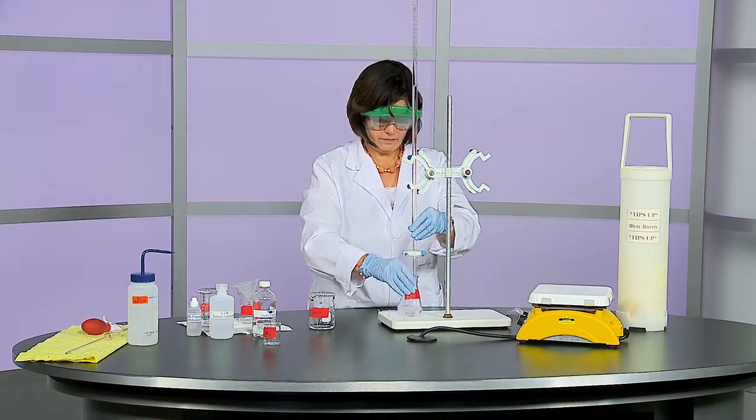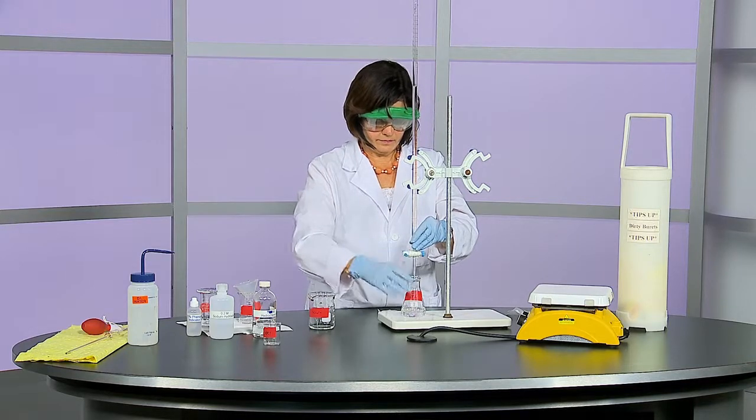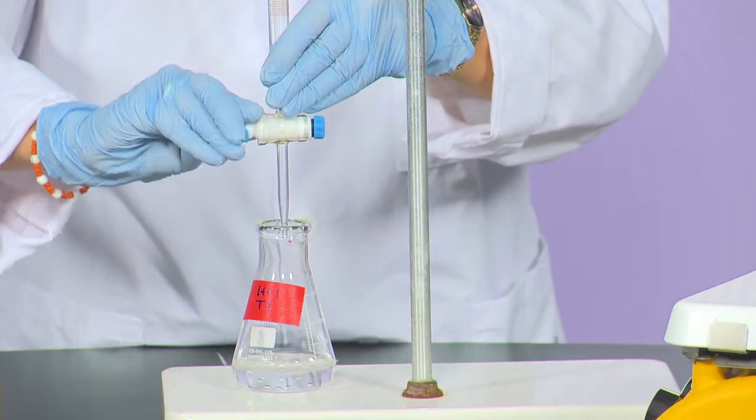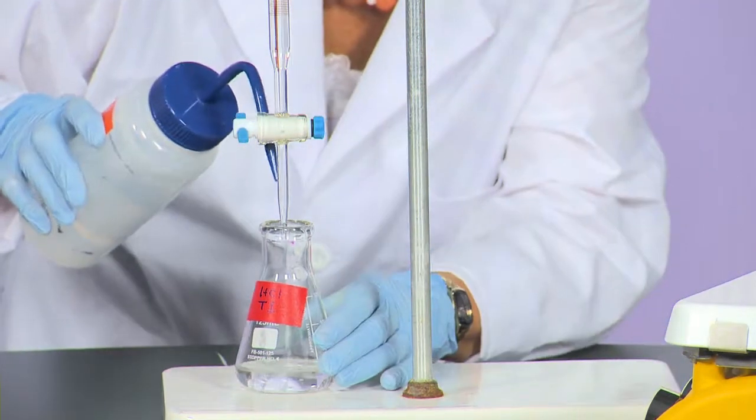One is rotating the valve very quickly. This works best when standing with your hand holding the burette slightly above the valve. Another is obtaining a half drop by closing the valve before the drop falls. Rinse the drop into the flask using the wash bottle.